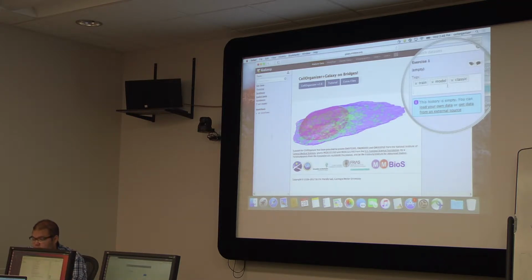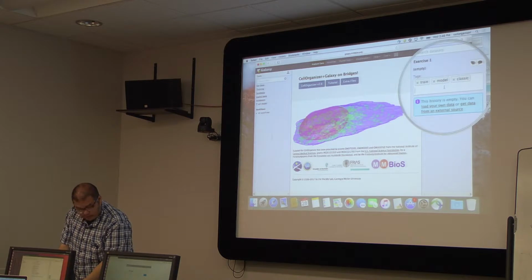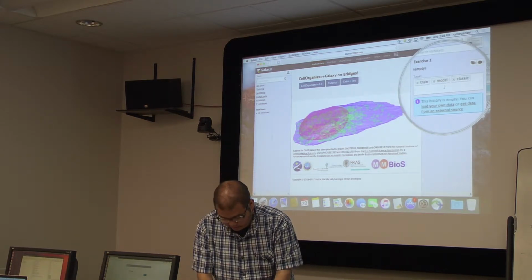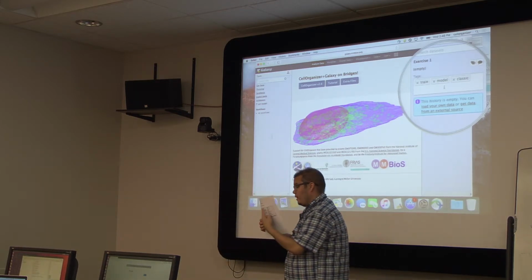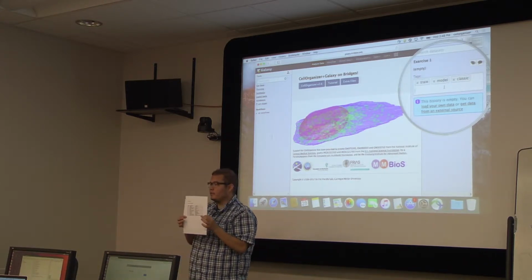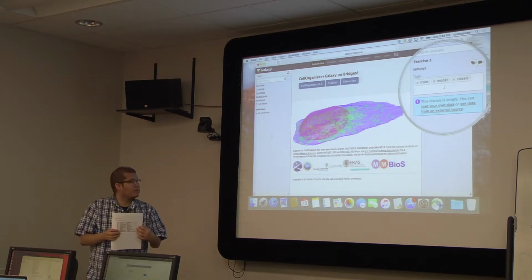So what we're going to try to do right now is to train a simple model. Like I was telling you before, this page over here, I told you that we always have to pay attention to this table, okay? The information, besides the images that the system needs from you, is dependent on the combination of model classes and types, okay? So if you want to train a diffeomorphic model of the cell, it will ask you specific questions about your images and so on.